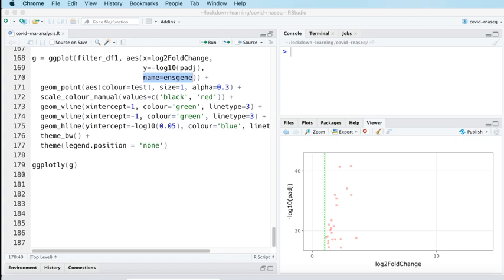There are databases of ID mappings that are distributed by Bioconductor that you could use to essentially do a lookup. There are packages which contain the annotation tables for particular releases of Ensembl.